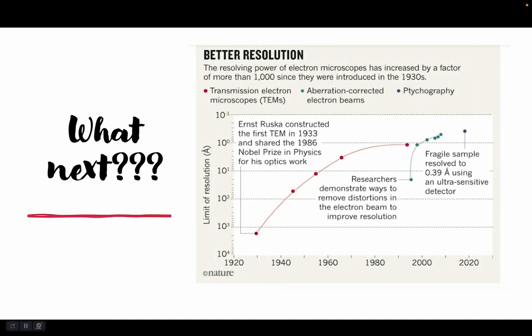Okay, so we talked about different microscopy techniques. Today, electron beam microscopy is used to study ultra-fast processes, magnify specimens to atomic scale resolution, and measure nanotechnology functionality. It is used at the cutting edge of quantum physics research today. I would like to mention some of the very interesting developments in the electron microscopy in the recent times that have opened the borders for study of structural dynamics at nanoscale.